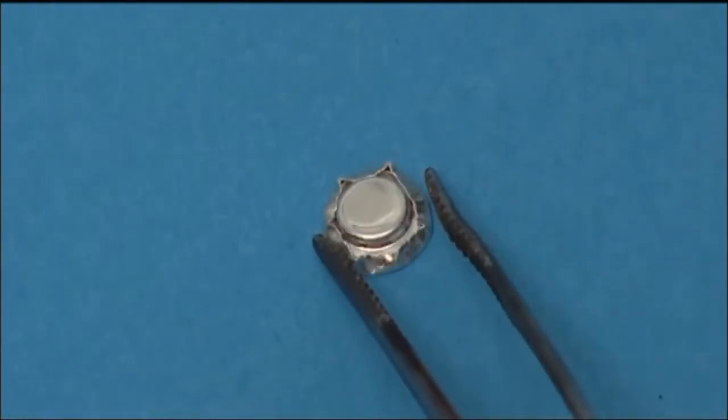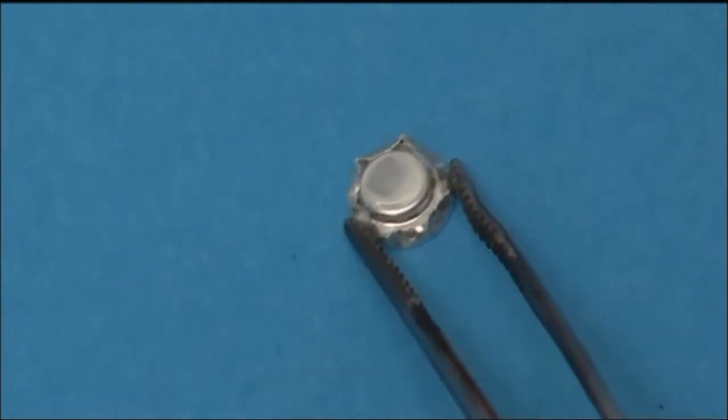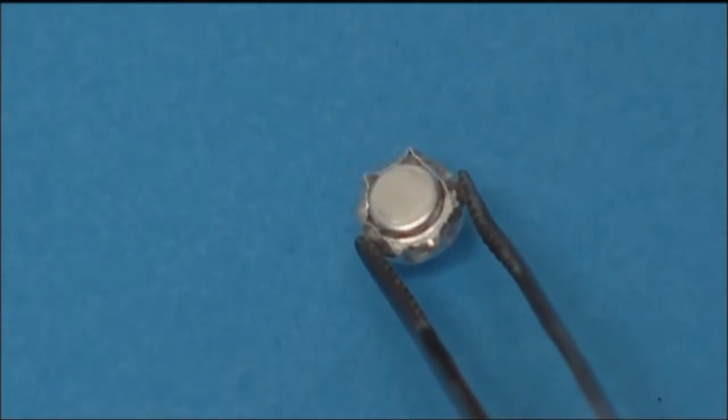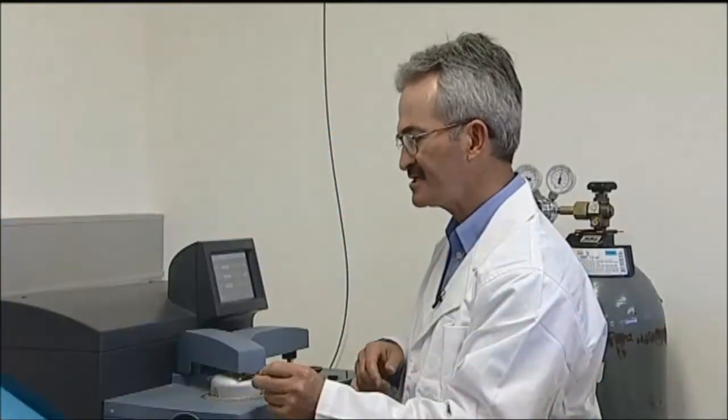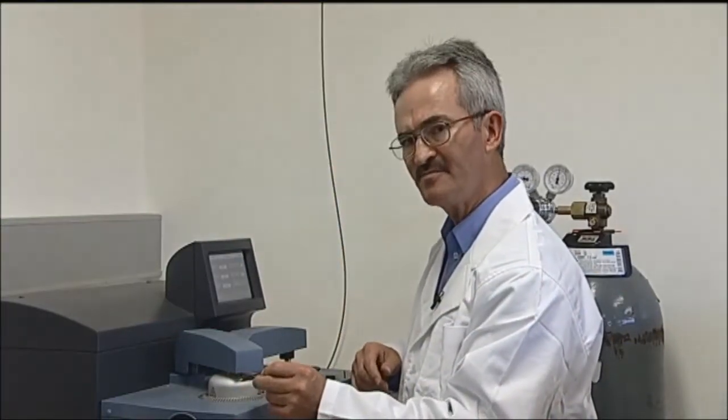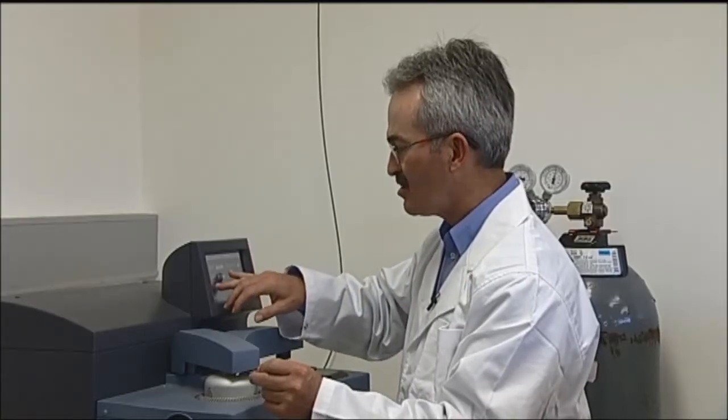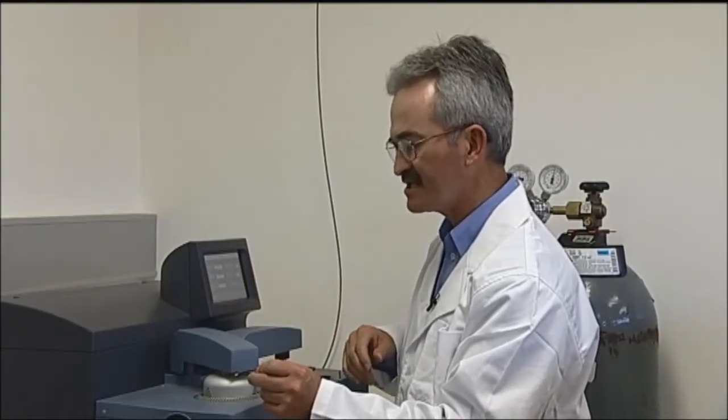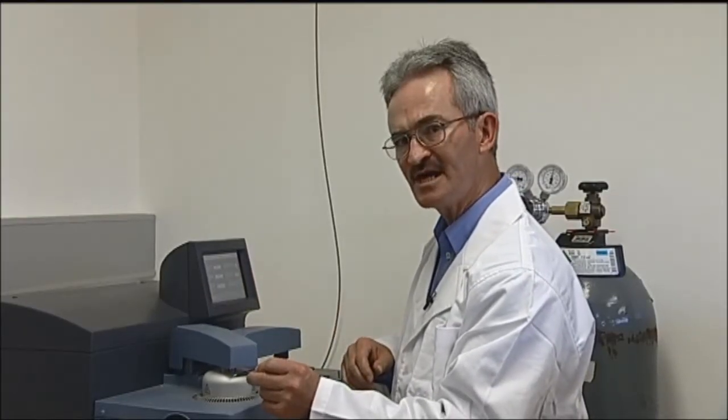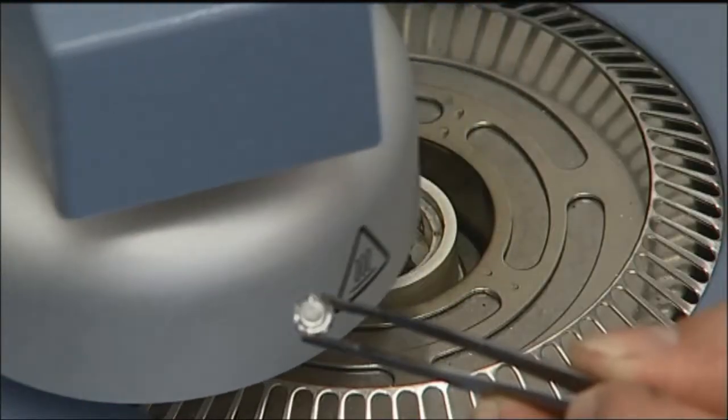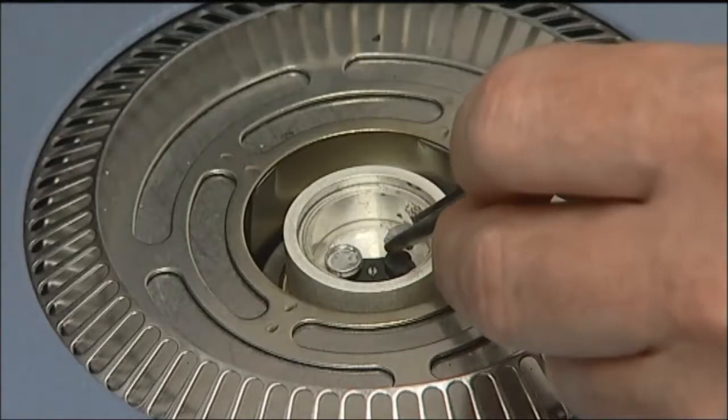Now we have sealed the sample inside the aluminum pan and we are ready to put it into the DSC instrument for thermal analysis. Here is the DSC instrument. We bring the sample sealed inside the aluminum pan, open the furnace of the DSC instrument, and get ready to put the sample on the right side of the DSC furnace.